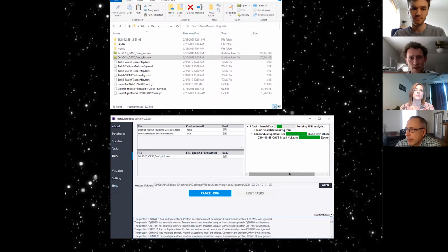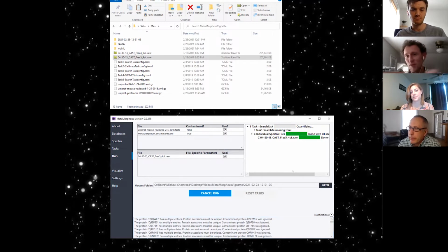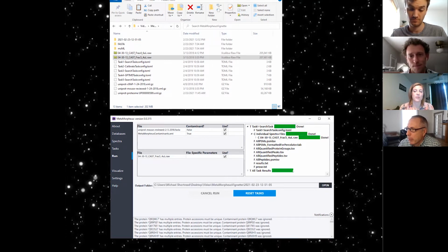There are different schools of thought on a vignette. Basically, with these files, you can go through, use defaults, and you're going to have results at the end. We're not going to be throwing errors or hitting more advanced problems. That's right. And we provide, or we used to anyway, the results of all of this. So you could pop open a couple of Excel tabs, look side by side, and you should get this same exact answer every single time.